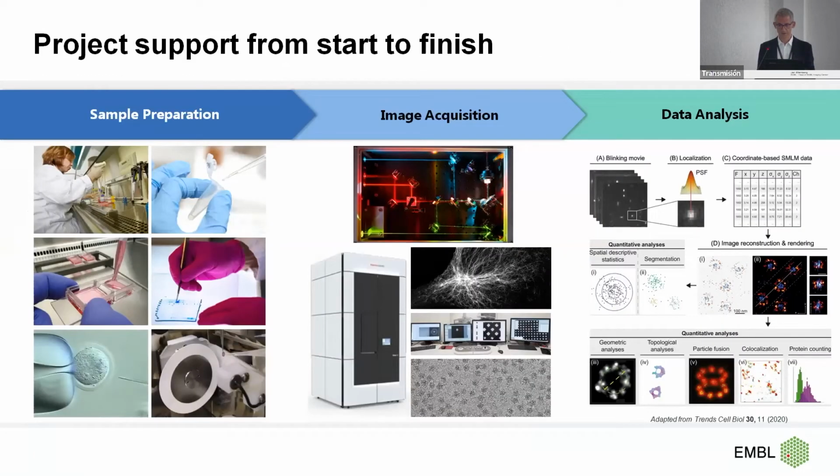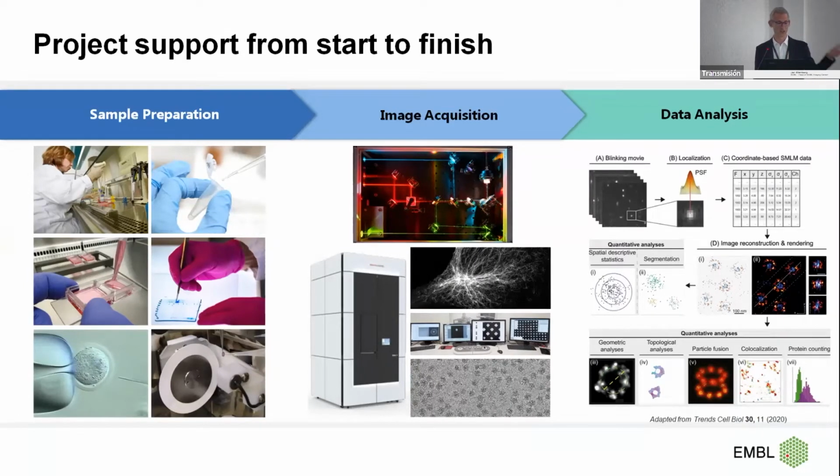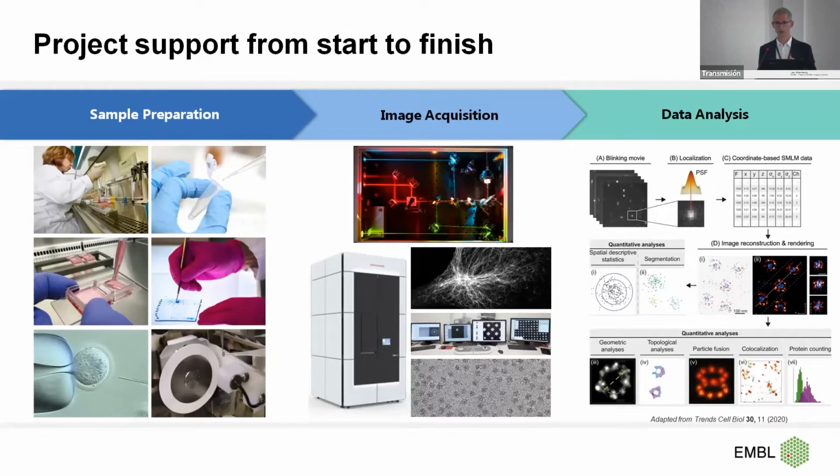So the instruments are really key to the success of this and having good infrastructure of that, but it's not only the instruments, it's actually helping people upstream. How do I prepare a sample for these complicated correlative integrative workflows? And how do I interpret the data? Because often it's a first of a kind project. These are pilot pioneering scientific projects, kind of data that has never been analyzed before. So you really need a lot of help for the users in order to be able to do this. But that's the goal really of this center, to bring the latest research grade technology that is operating only in the best laboratories in the world to the open user community and to everyone who wants to come.